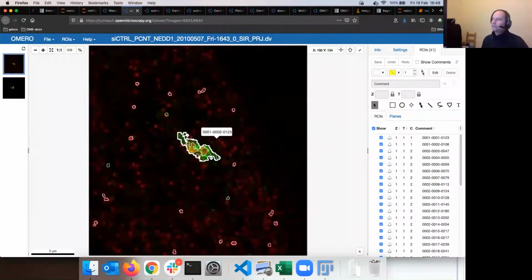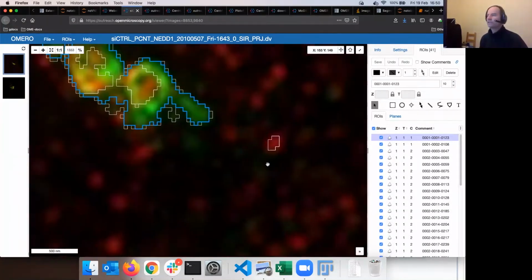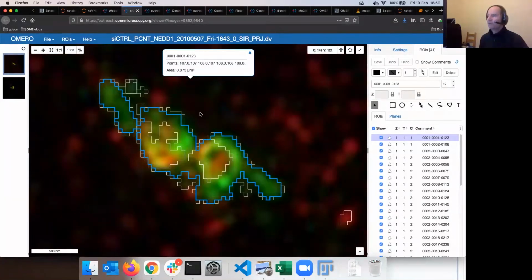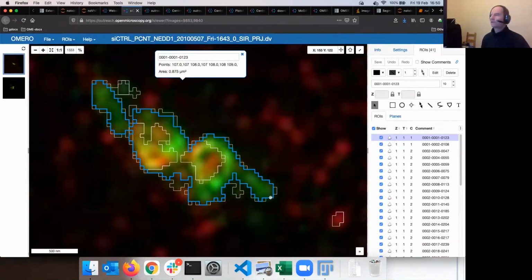As I said, the biggest region of interest in the image is the only one which pays. In this analysis, in the tables which we have on those images, if I click and select this region of interest, you can see immediately the problem here. So the bounding box area would be something like this. This would be a bounding box around this region of interest, which is quite large because the region of interest has an unusual shape.